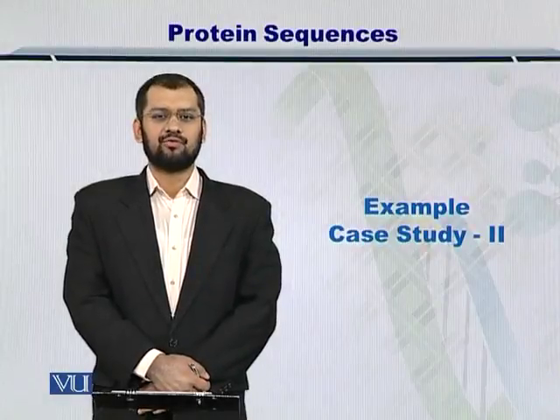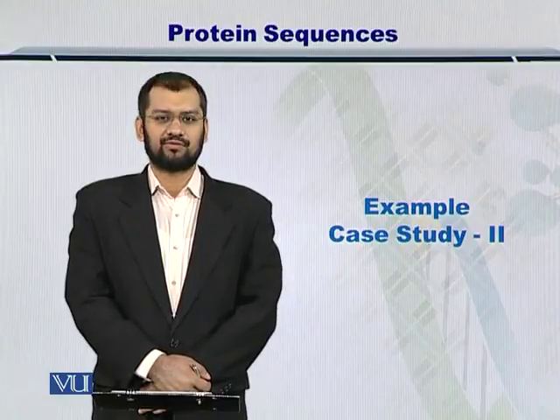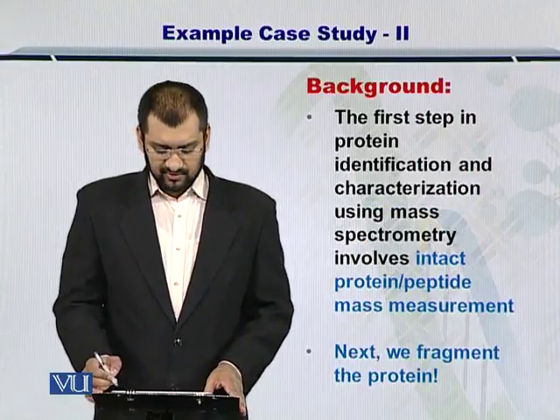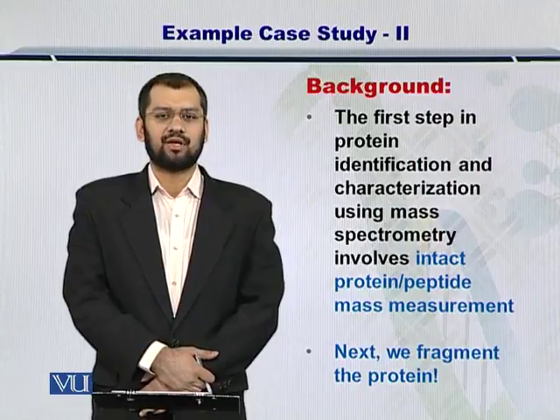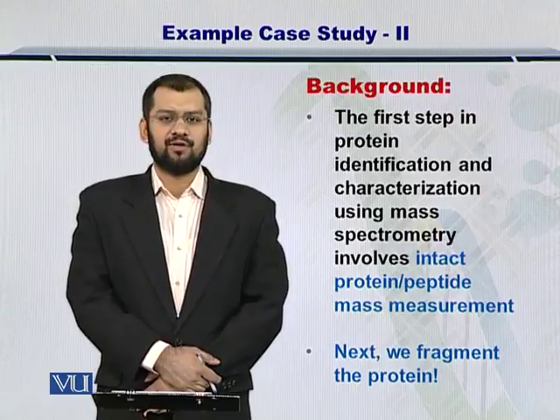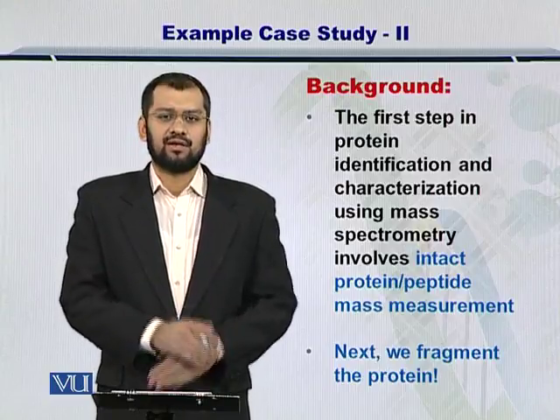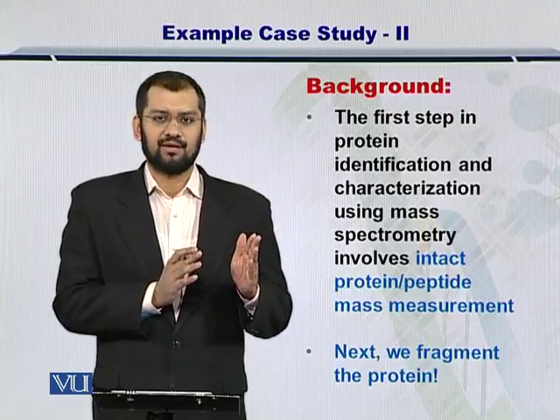Dear students, in this module, we continue with our case study on mass spectrometry-based proteomics. So this is the second part of your case study. And as you know, mass spectrometry-based proteomics begins with measurement of intact protein or peptide mass. So let me briefly mention that the intact molecule may be a protein or a peptide.